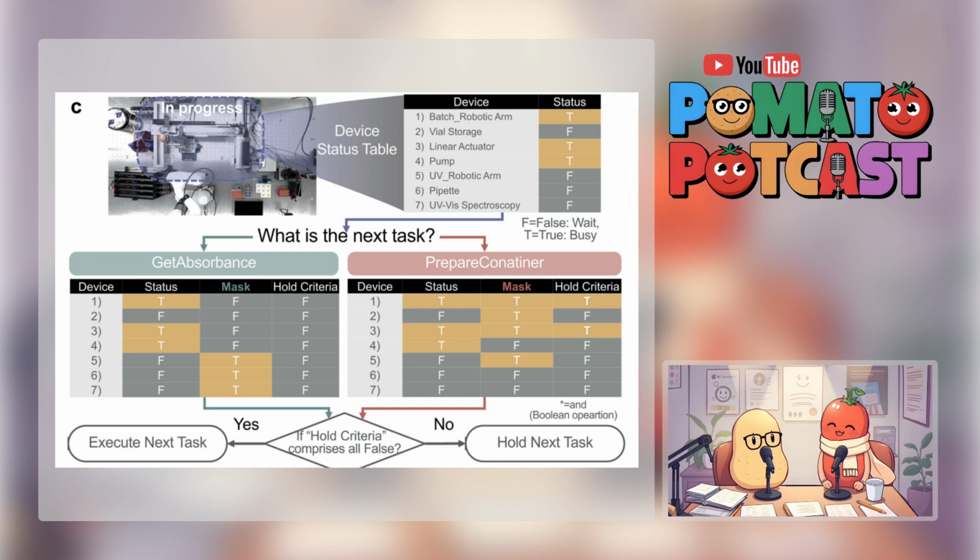Oh, I can only imagine how frustrating that waiting game can be for researchers. Exactly. And the user optimal scheduler minimizes that wait time. It's all about squeezing every bit of efficiency out of the system. So it's like getting express service for your research. I love it. Right. But there's always a trade-off. The researchers did find a slight increase in something called job turnaround time. Job turnaround time, huh? What exactly is that? That's the total time it takes for an experiment to run from start to finish. So from the moment you hit submit to the moment you get your results.